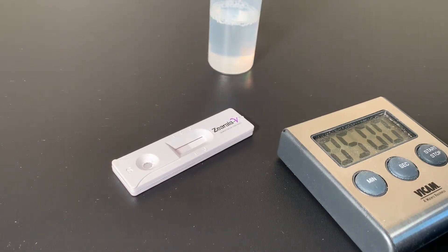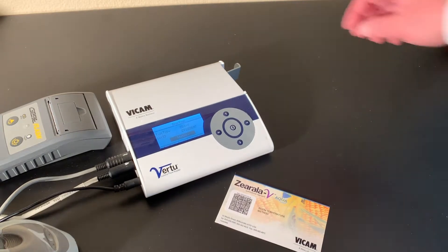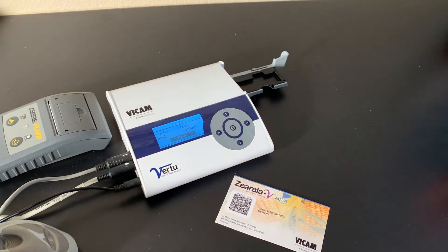Place the strip on a flat surface for 5 minutes. While waiting, scan the Virtu calibration barcode for the Zarella V Virtu test. This card is unique for every lot of strips.